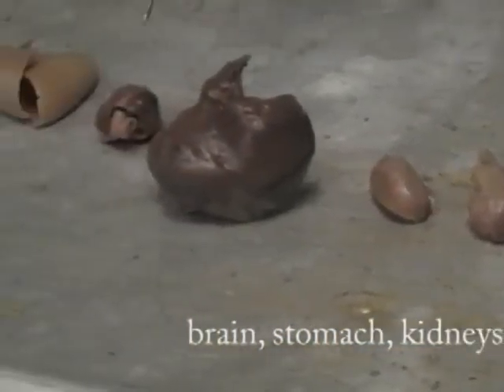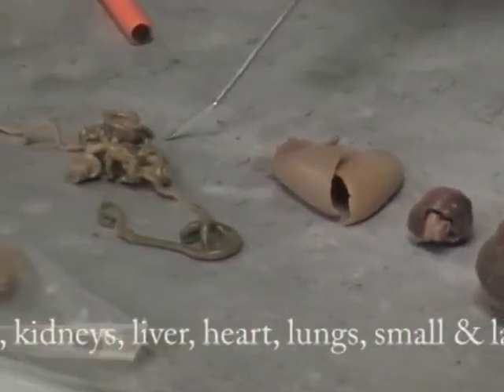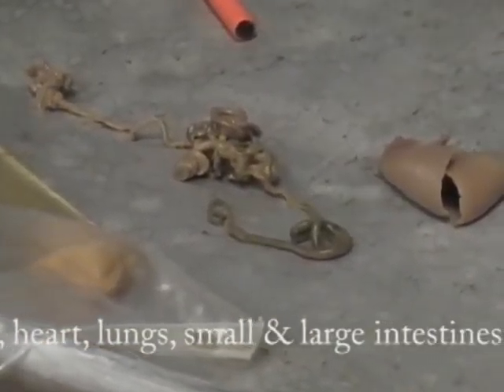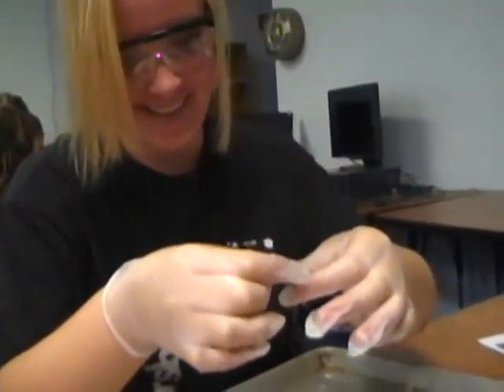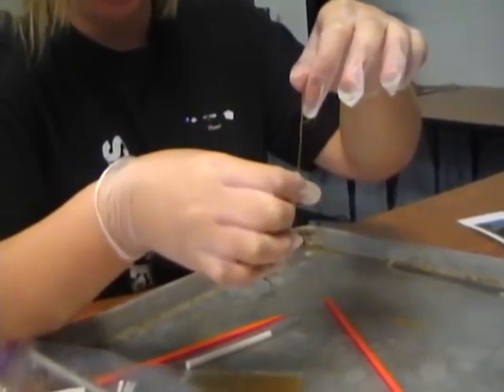Two kidneys, the liver, heart, lungs. Okay, guys, we still have a couple minutes left. Small intestine, large intestine. Right there. All the chunks, all the hooks. The spinal cord. Ew. Spinal cord, like a worm.